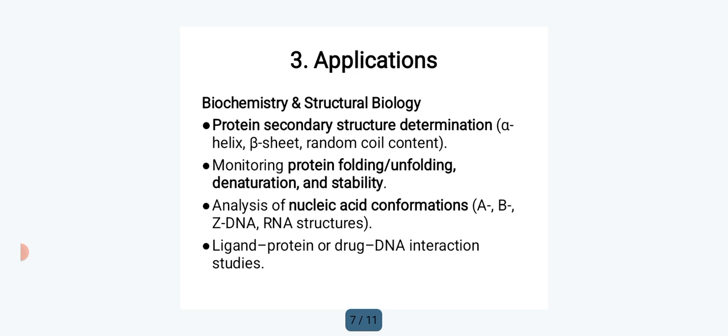Regarding protein unfolding, if you add SDS, an anionic detergent, the detergent unfolds the protein and converts it into a linear form. Generally, if you isolate protein samples, we can do both qualitative and quantitative analysis.